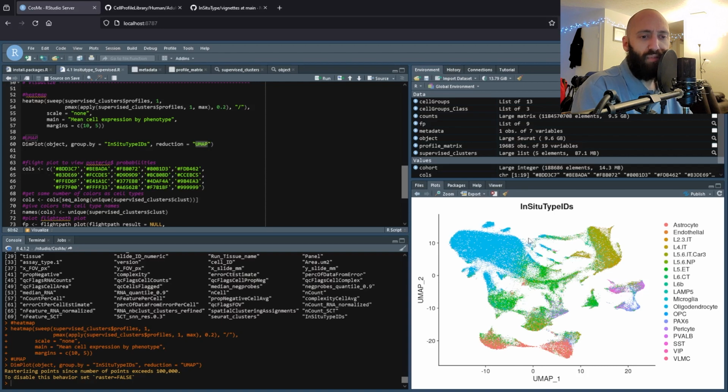Green is in the middle, different layers, and then yellow over here. So we can see that the clustering did a pretty good job. So remember, this is only a 2D representation of high dimensional data. So some of them might kind of overlap in the 2D space, but we can visualize that.